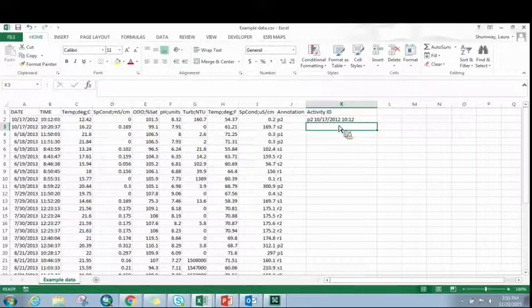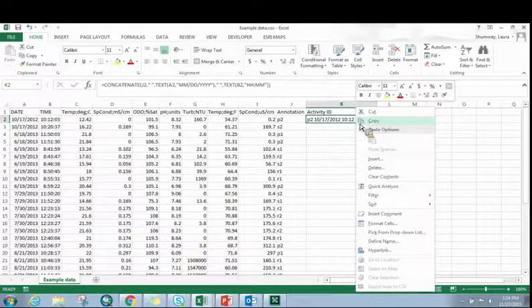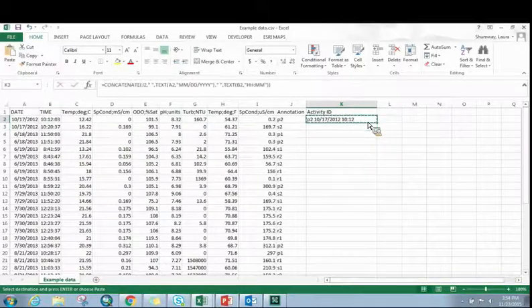So it says this happened at P2, on date 10/17/2012, and this happened at 10/12. What I'm going to do is copy. Actually, you don't even have to copy. Watch this.